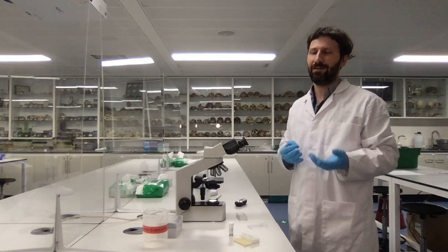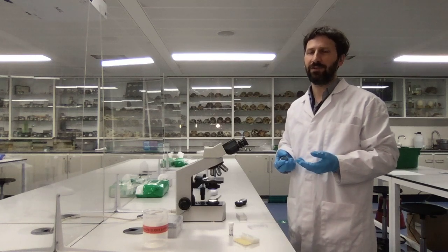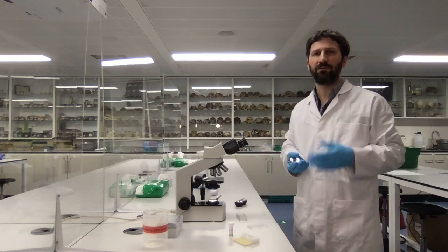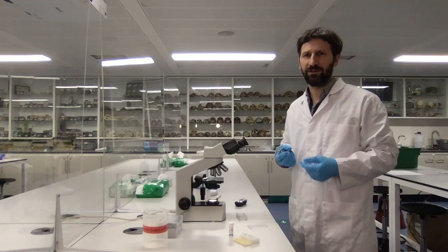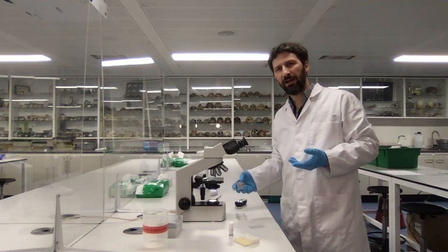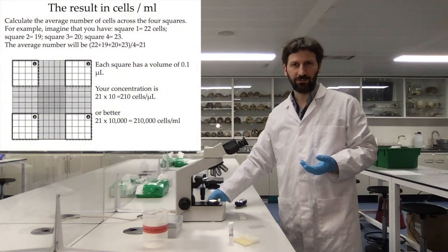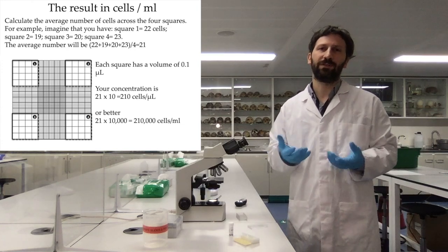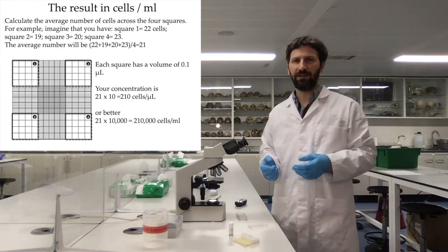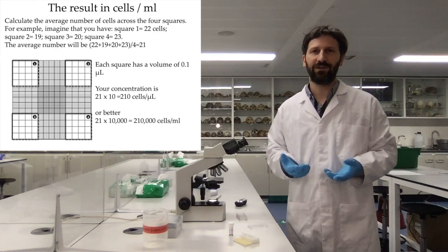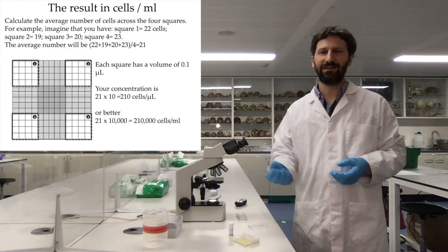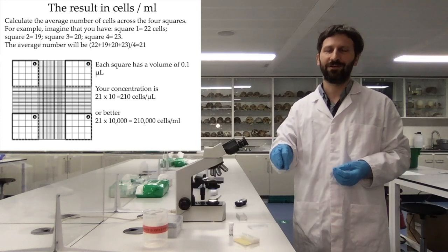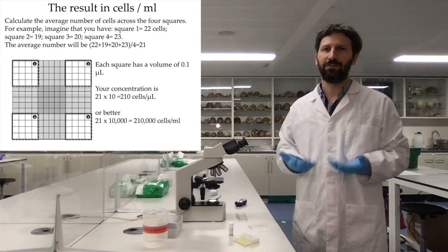As a rule, I count all cells that touch the top and left edges of the square, and exclude those that touch the right and bottom edges. Once I have my count, I repeat it for each square and take the average for a more precise estimate. With Euglena in particular, I need to be very quick, because as they can sense light they will move towards it — if you wait too long, you will find all of them clustered in the same corner, and your density estimate will be biased.